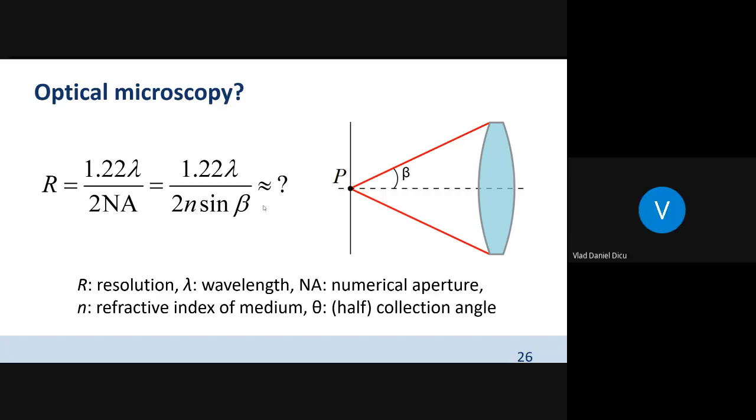Well, if it's optical microscopy, then it should have a lambda from about 300 to about 700 nanometers, right? Yeah, I think that's fair. Would you rather go for 300 or for 700 nanometers? Well, 700 nanometers. Okay, but if you want to have a higher resolution, that's a little bit of a misleading term, but if you want to differentiate as small as possible structures, would you choose rather 700 or 300 nanometers?